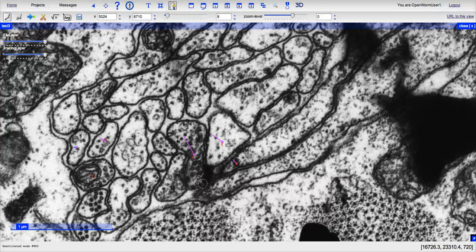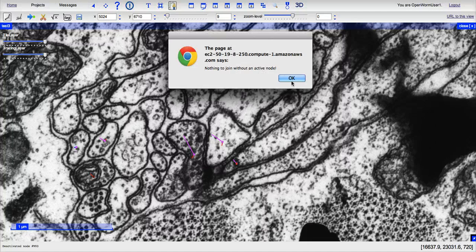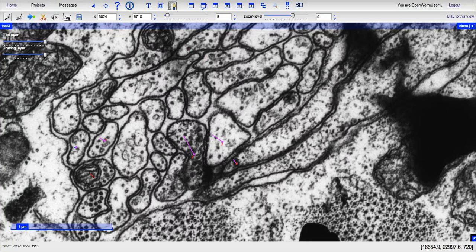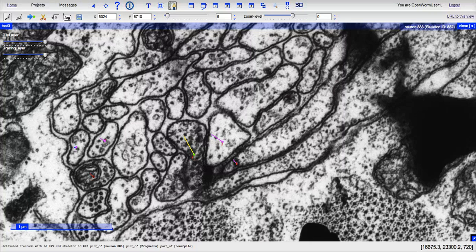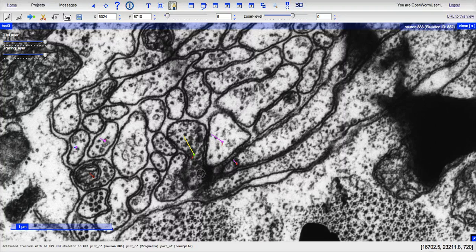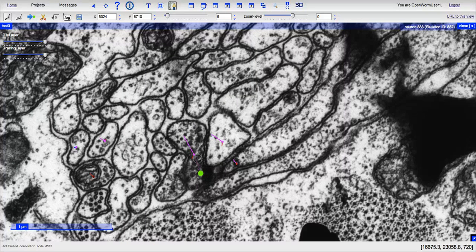To mark a synapse, first you have to make sure that the presynaptic cell is the active node, which you can do by clicking on it with your left mouse. Once you have the active node, you can hold down shift and left click inside the presynaptic cell.